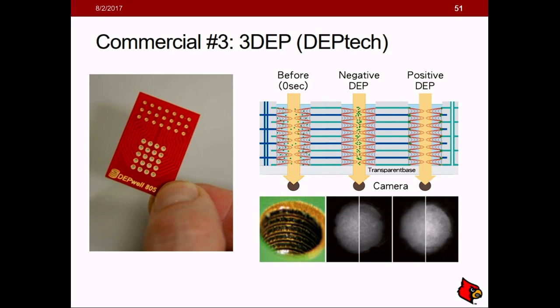So you have, in effect, a quasi-three-dimensional configuration of interdigitated electrodes. And then you have your positive dielectrophoresis, where particles are attracted to the edges. A camera can monitor light shown through the device, and you can see how rapidly particles are attracted to the edges or repelled to the center. From that, you can extract a Clausius-Mossotti factor of your particles.